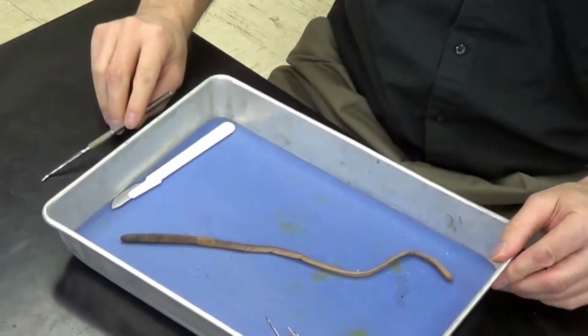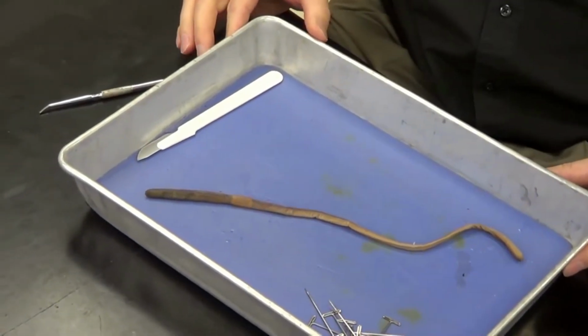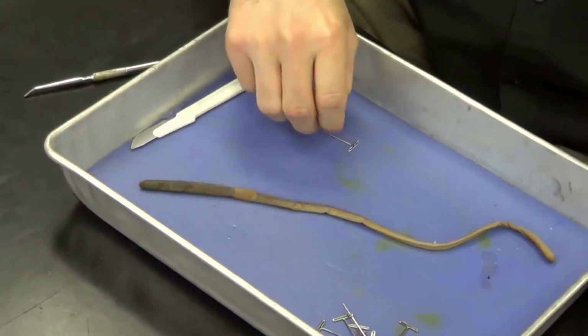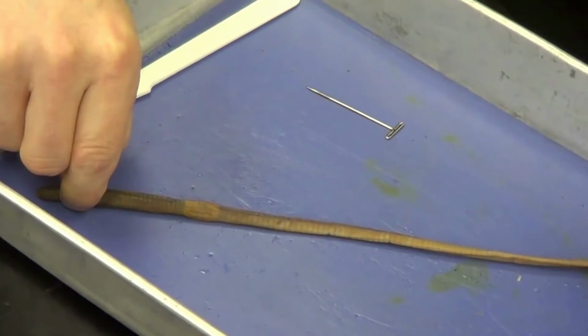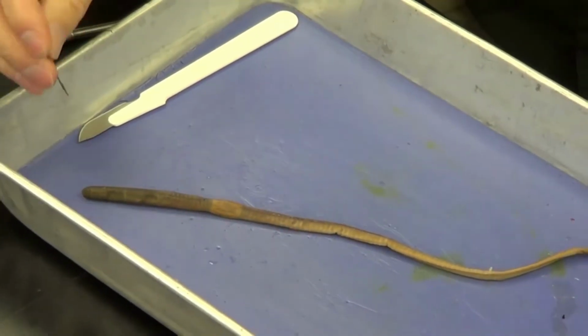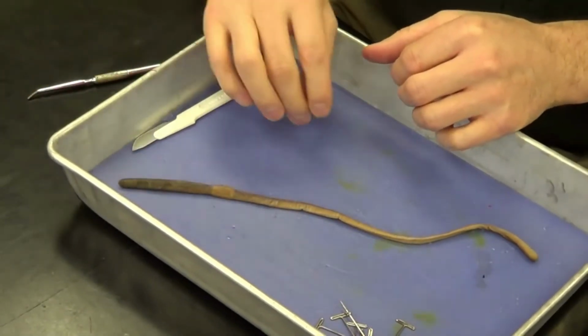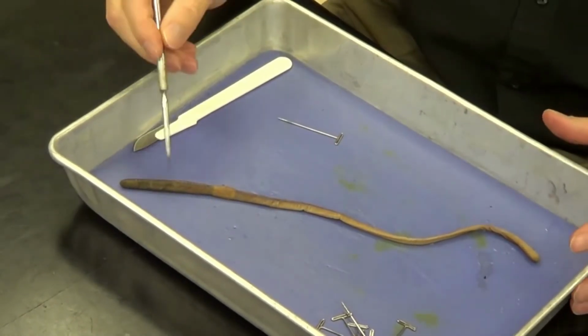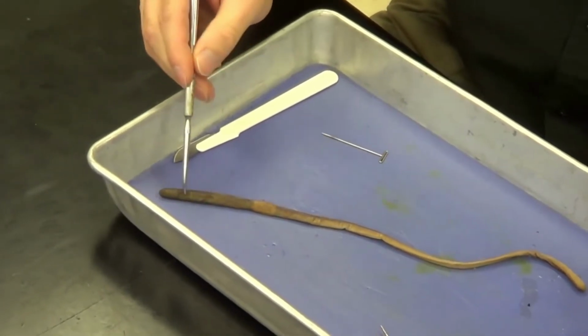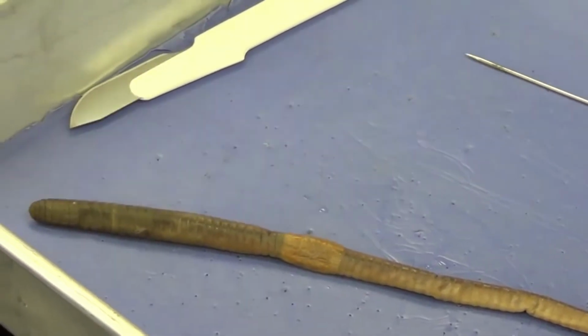So we have our earthworm in the dissecting tray, and these are fairly large earthworms. So what I would like you to do is to pin the earthworm diagonally across the dissecting tray. And we're going to take 2 pins, and I'm going to take the 1 pin and put it in the anterior aspect. Now the anterior aspect is going to be the larger part of the worm. This is the head portion of the earthworm, where all the organs are going to be located.